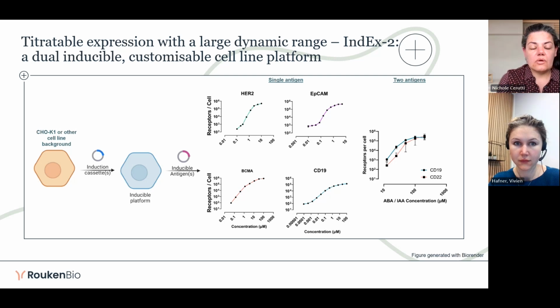So we then sought to see how we could integrate the use of this novel inducible cell line expression system with the scIC using the Helix Cyto instrument. And the main question or point of interest that we had was, what are the effects of target density on the kinetics of antibody binding?